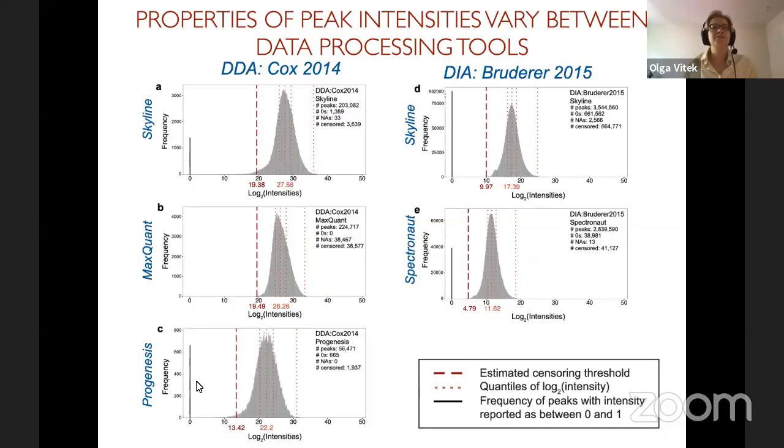And so what we decided to do, since we want to work with different converters and make this tool available and work with all of these tools, it is not really possible to take the output of these tools on the face value. We need to essentially be able to say these peaks have some uncertainty in them versus some other peaks have a better quality, just in terms of peak area integration and being able to quantify that.